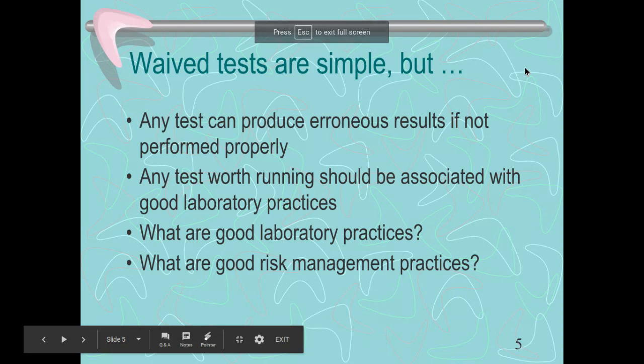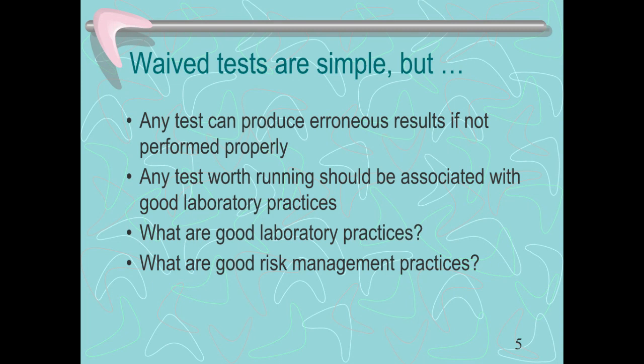So let's get back to our waived testing. Like I said, waived tests are simple, but once again, we have to be really careful to follow the directions correctly. Tests we run should be associated with good lab practices. We need to be sure we're using gloves, we're using appropriate timers, and we are in a designated area just specifically for testing. We want to make sure that we separate specimens so that there's no accidental mix-up.